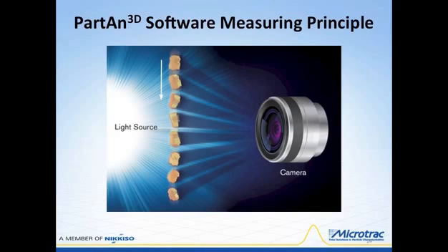This diagram shows the basic 3D measurement technique patented by Analytical. A particle tracking algorithm is used to take multiple photos of each particle tumbling randomly through the sensing zone. The largest sizes measured in the series of individual particle images are assigned as the 3D sizes for that particle. The smallest size is assigned as the thickness for that same particle.